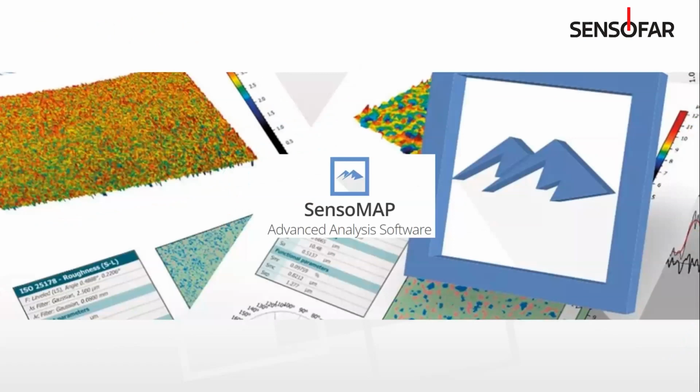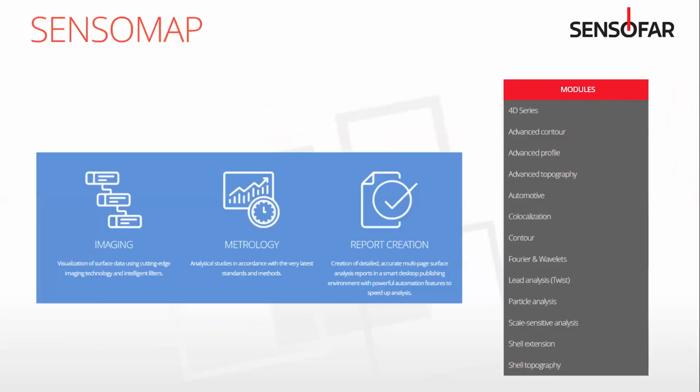So that is Senso Pro, and the final software that I'll talk about is Senso Map, which is our most advanced analysis software. Senso Map is the most powerful and most complex to wrap your head around and understand how to make work. It's a little bit slower than Senso Pro or Senso View, but as you can see, these modules have a bit more flexibility and are a bit more powerful.